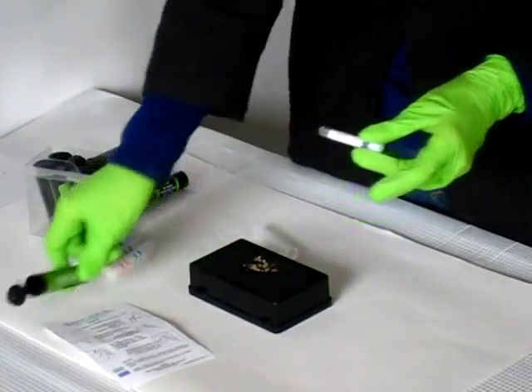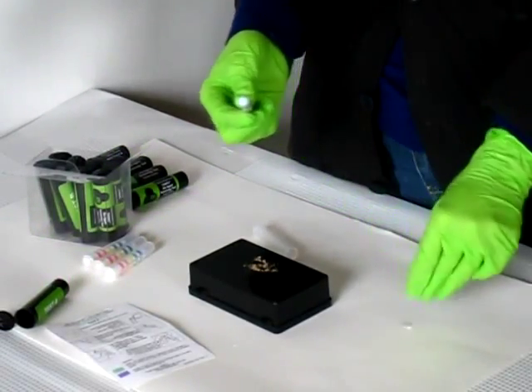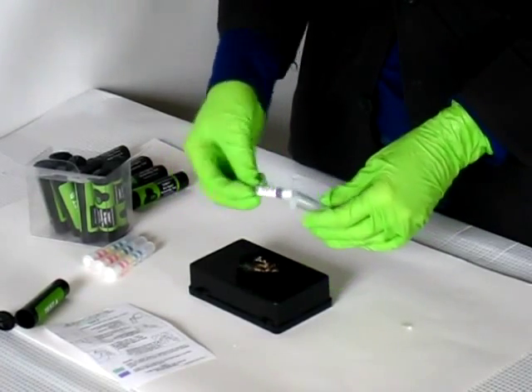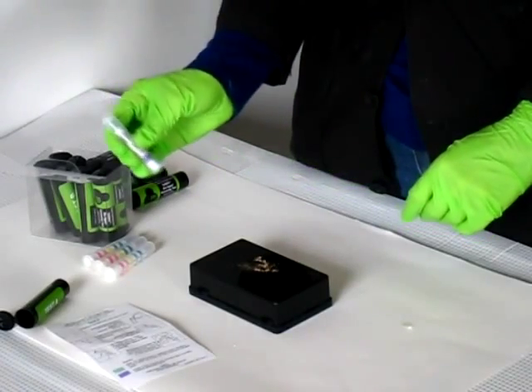Remove the sampler from the inner tube. Remove the tab from the sticky sampler tip and dab the sample with the sticky tip. Once you've picked up the sample, return the sampler to the inner tube, sample side first, and close the cap. Break the ampule and squeeze.